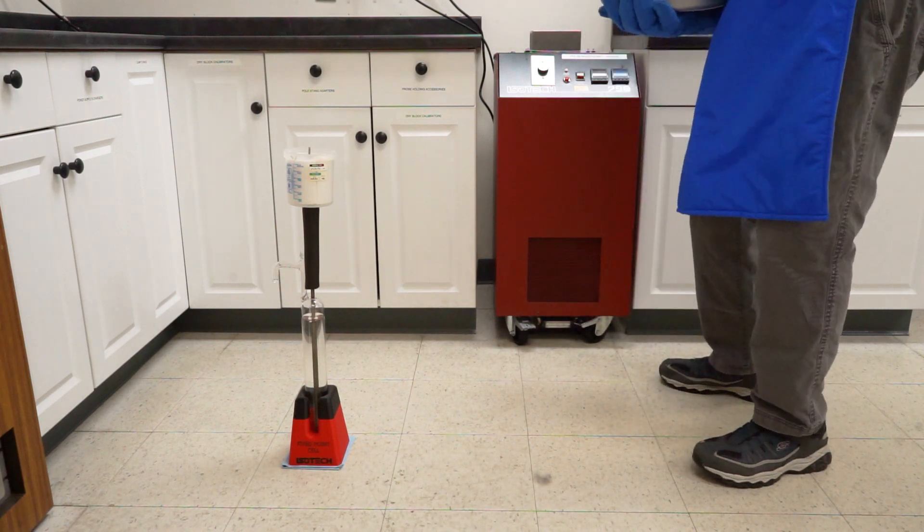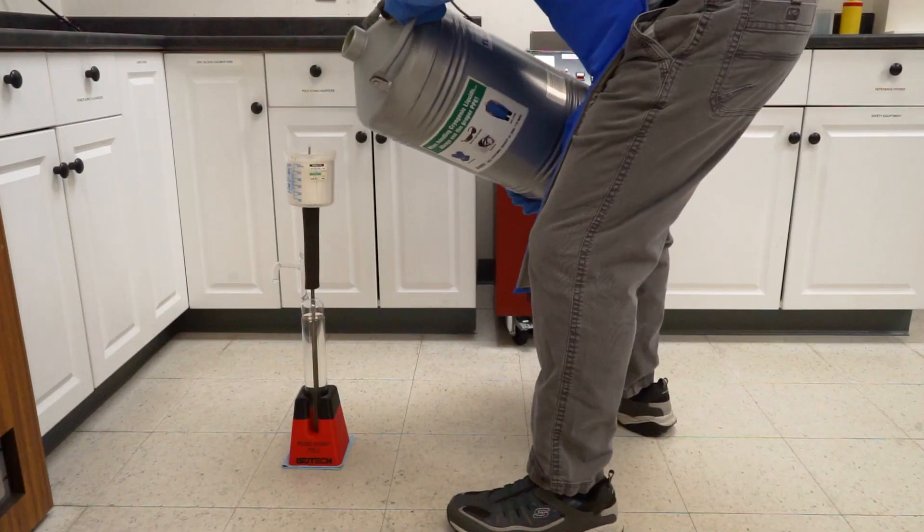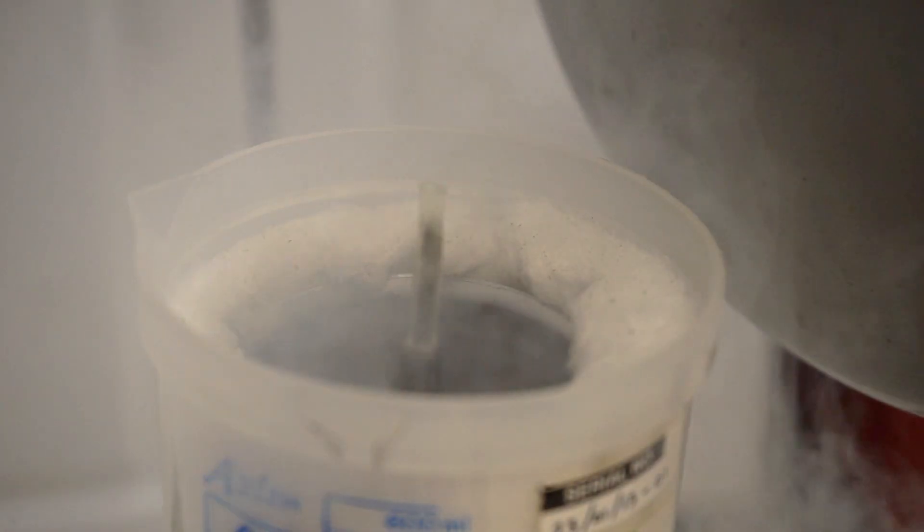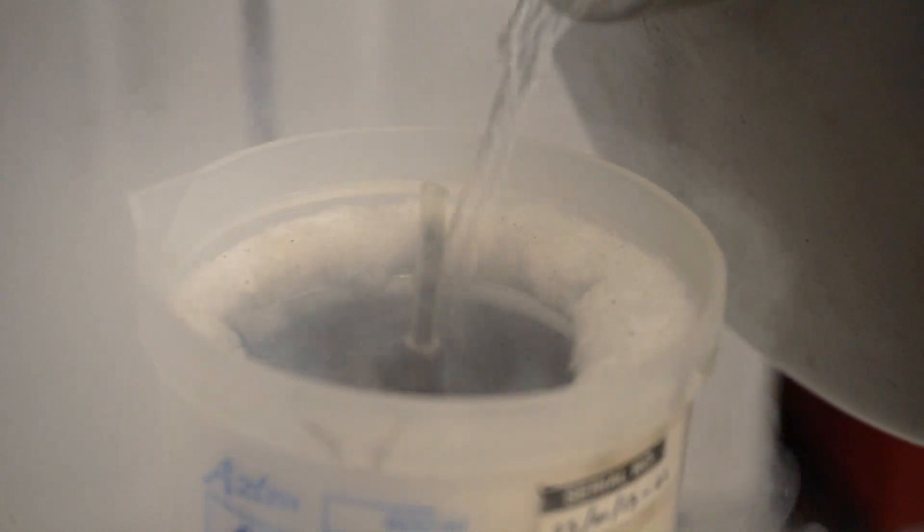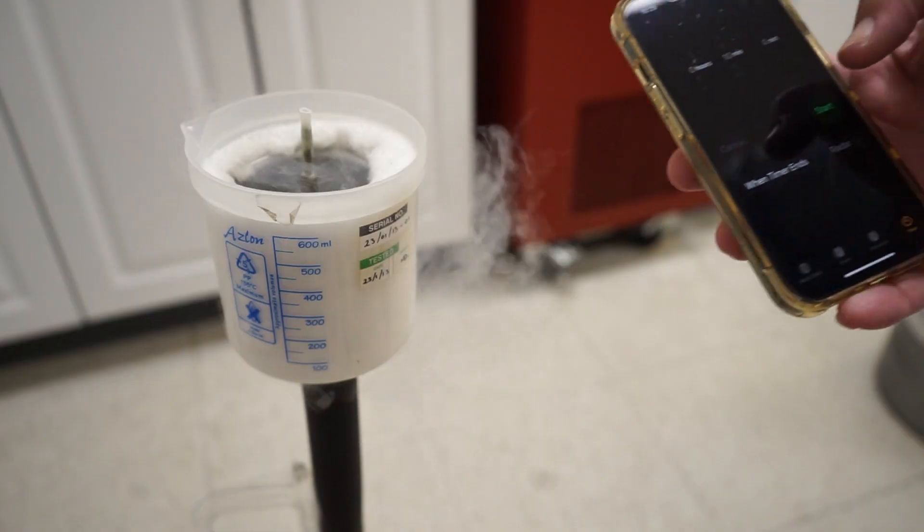Take the liquid nitrogen doer and begin to slowly pour the liquid nitrogen into the mantle maker. It is important to understand that the mantle maker is not able to bear the load of the doer, and that you must not rest the doer on the lip of the mantle maker. Continue pouring until the level reaches near the top of the mantle maker. Then, set a timer for 10 minutes while the mantle maker cools the cell.